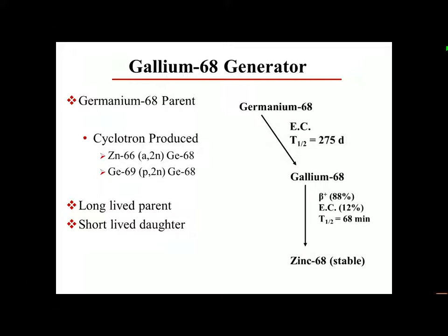So it's not like technetium in that the FDA has already stated they will not approve this generator as an approved generator. Currently, dotatate has gone into the FDA as well by AAA. This is another positive, the dotatate. It will be labeled with gallium, and again, it's a kit formulation. Then you elute the generator, essentially add it through a sterile filter into the final product vial.